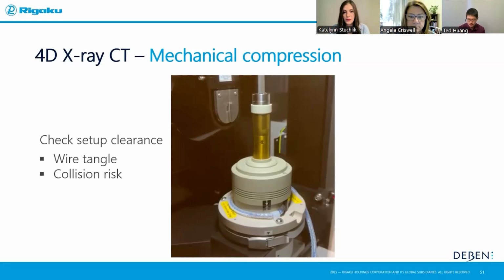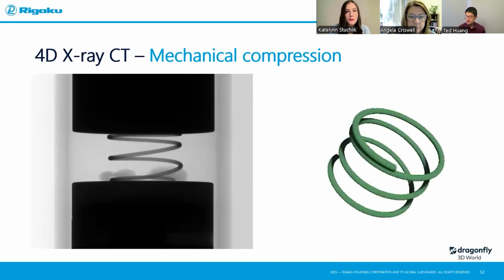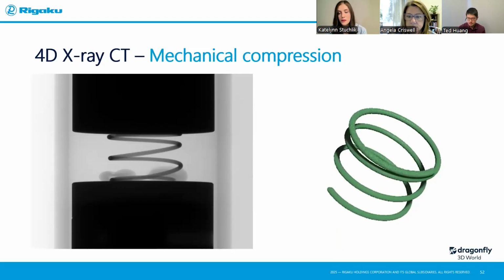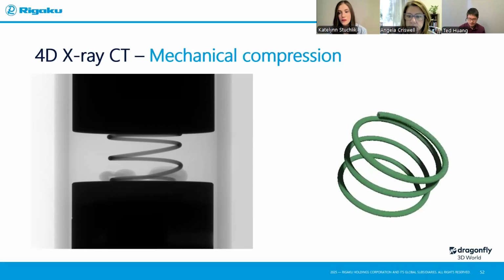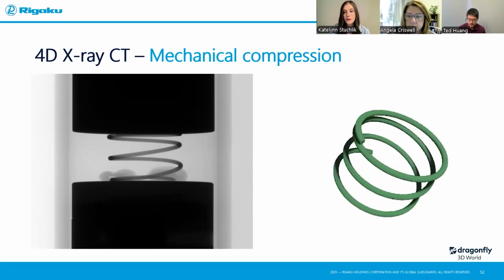And once those are confirmed to be not the case, well, now you can get into the actual in situ experiment to the control interface. But before that, you probably want to do a scan before you do any compression test. In this case, the spring will just bounce back. I can do it multiple times. But for your more destructive testing that will crack your sample, for example, you definitely want to scan your sample first, retain its pristine structures. In this case, I scan the spring. Quite straightforward. It's just a spring on the right side, segmented data, just showcasing you how it looks like.